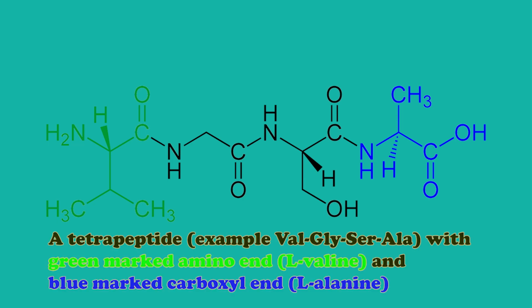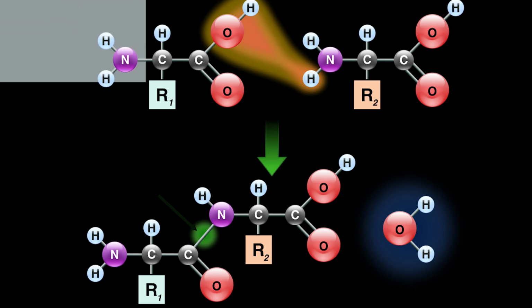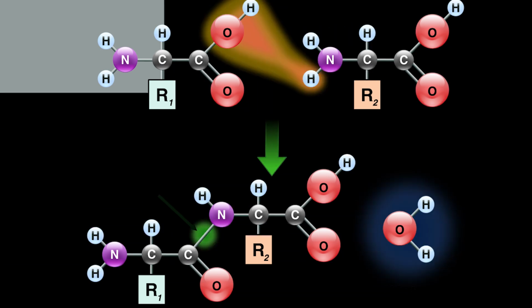Peptone. Peptones are short chains of amino acids linked by peptide bonds. A polypeptide is a long, continuous, unbranched peptide chain. Amino acids are basic requirements for the growth of bacteria. Peptone also provides nitrogenous nutrients for bacteria.